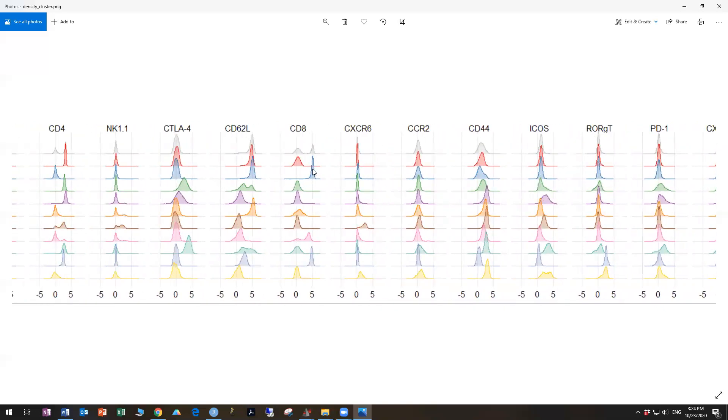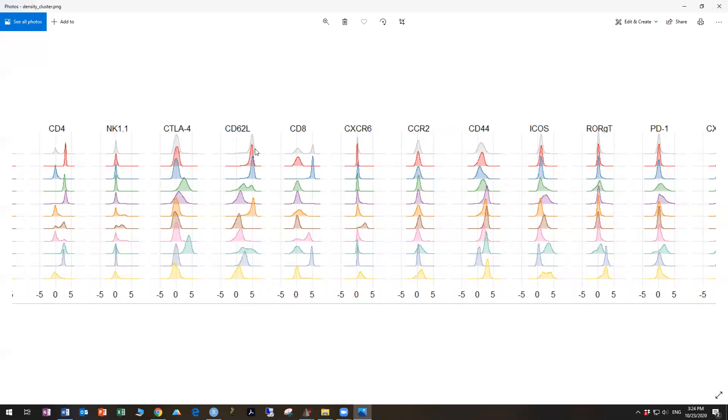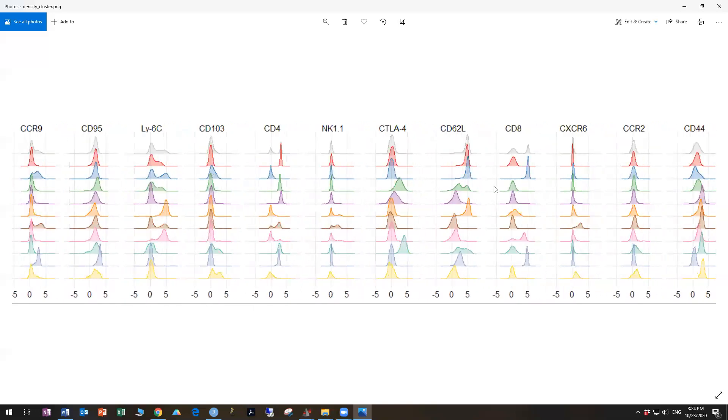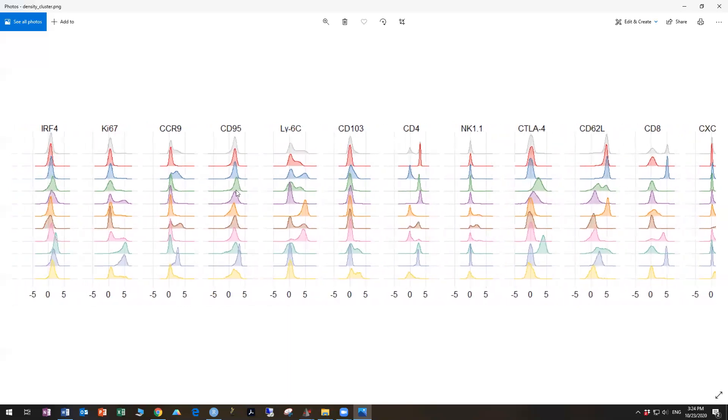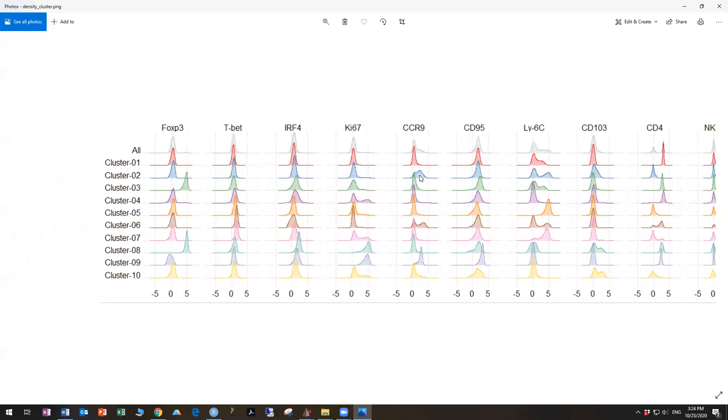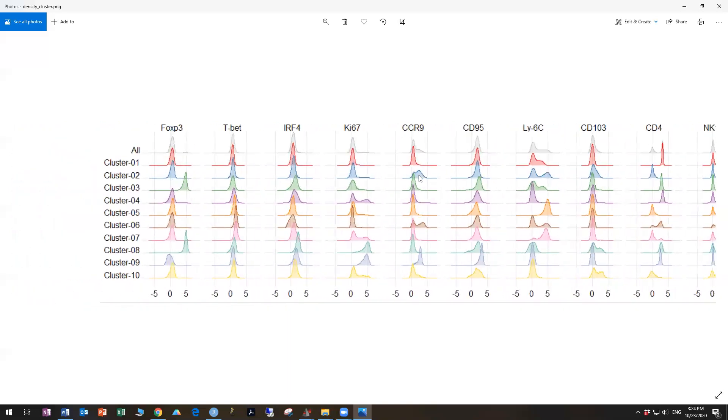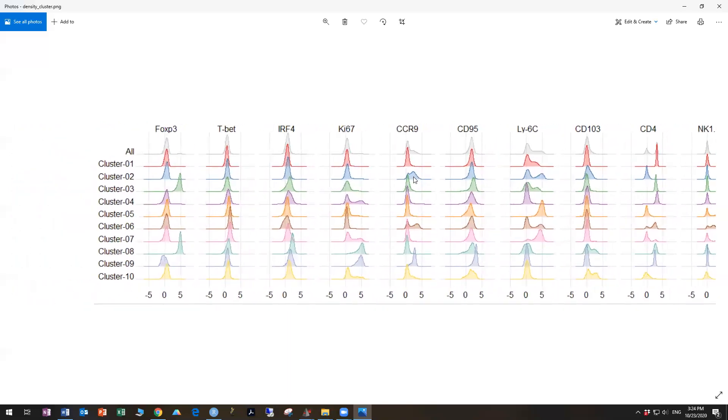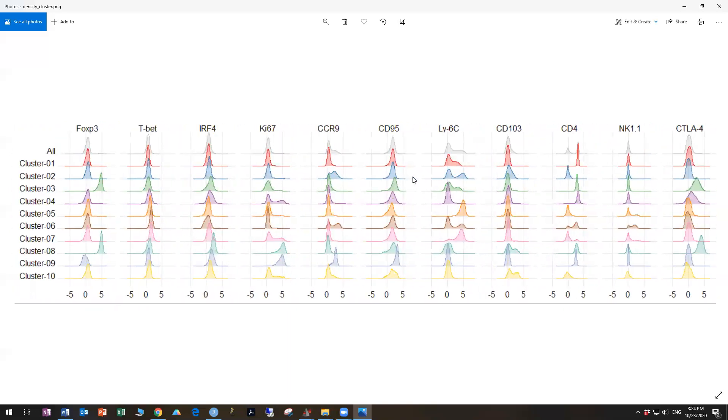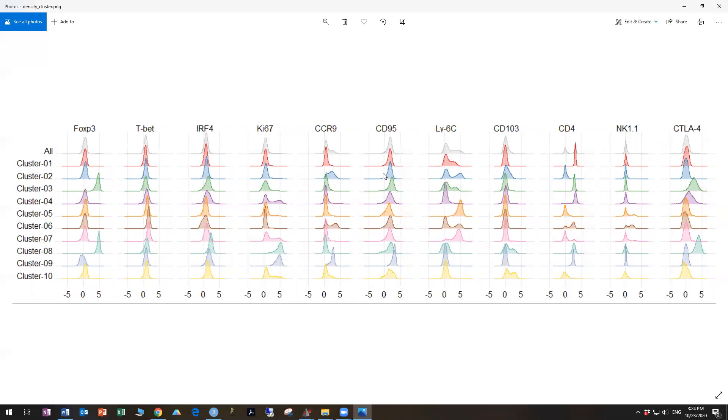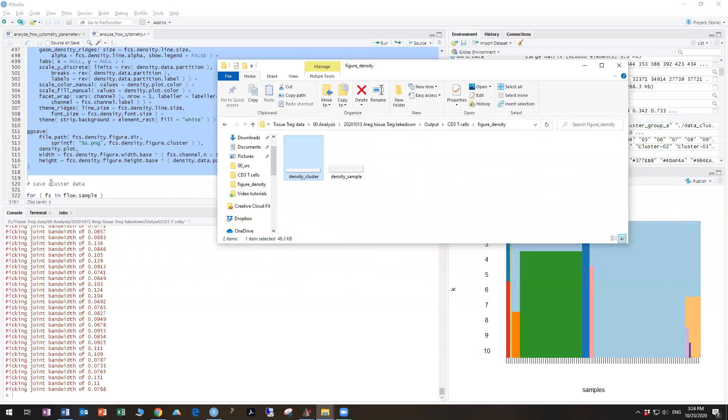All right, so we can go across, we can see that cluster two contains CD8s. What's more interesting is that both cluster one and cluster two have high CD62L. So they're both naive subsets, which makes sense. We have naive CD4s and naive CD8s. And because those are clusters one and two, that means those are the most common cell types present in our T cell population, which again, should make sense from a biological perspective.